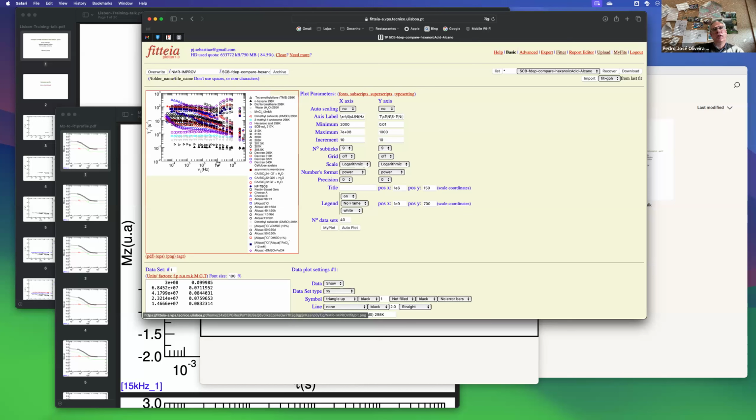Please note that nowadays the most recent equipment is able to cover pretty much the frequency range that I'm showing here, perhaps not the points at 300 and 400 megahertz, but I think the most recent machines go to frequencies of 100 megahertz or even more.